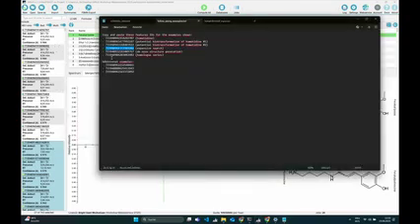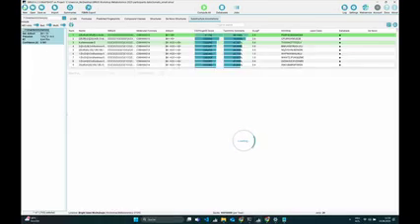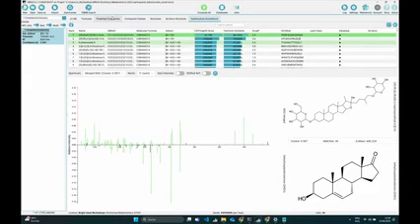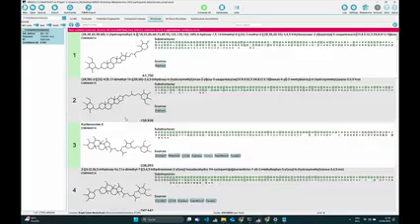Okay, now I will just copy and paste the next feature ID to go through this quite quickly. We look at this one. This also has a high confidence score, 0.98. And if we look at structures, we will see that there's now a red banner. I just wanted to show this very quickly, because this is an example where we have performed this expansive search. We couldn't find a really good hit in our default selected biodatabases. The best hit in our biodatabases would be the 3rd one, but we have found a better hit in PubChem. We didn't search originally in PubChem, but we have this option that if we don't find any good hits, we will as a fallback search in PubChem, and we will get these hits now, which seem to fit quite well.